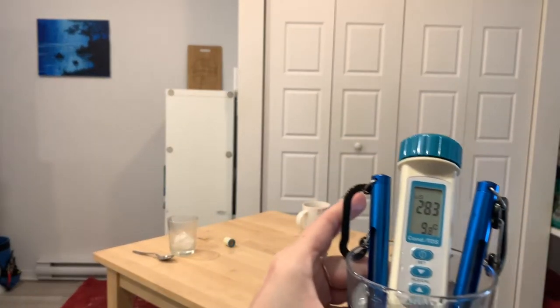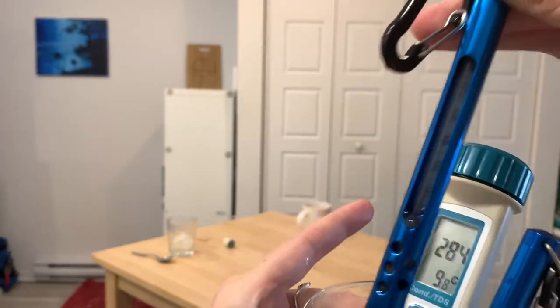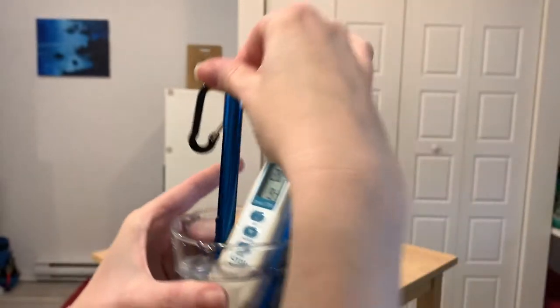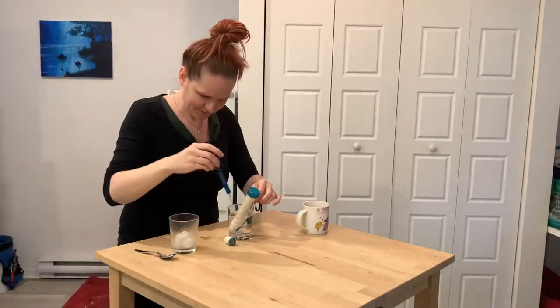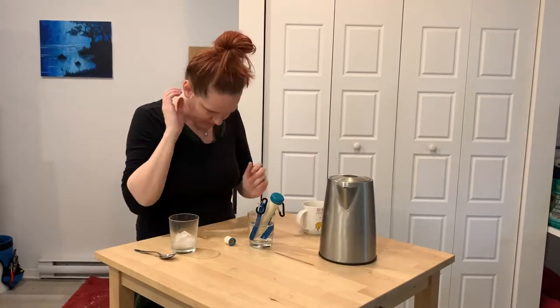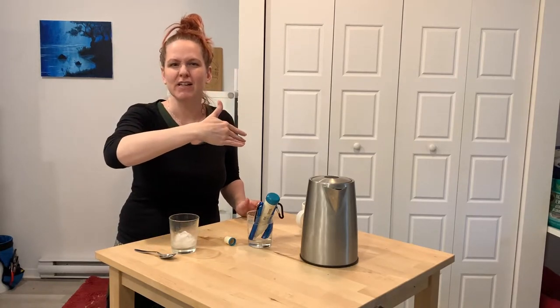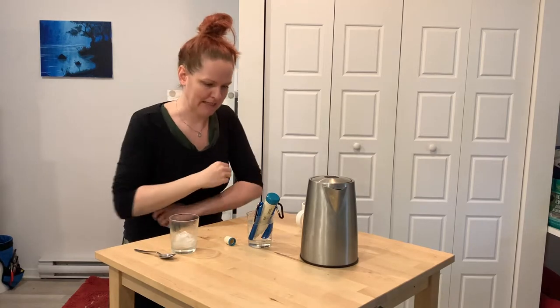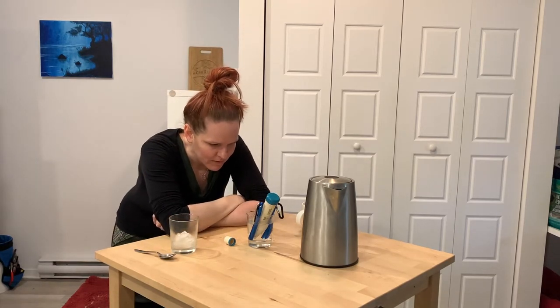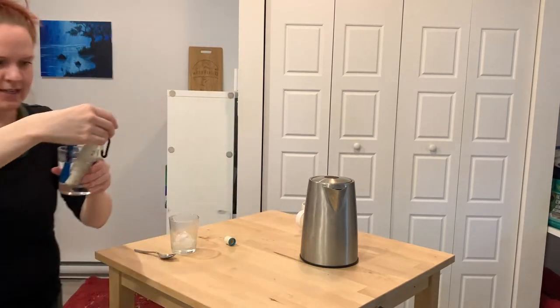We're about just shy below 10 degrees, and as you can see, 10 degrees — superb. I'm trying to look for readings at every five degrees as I go up. Now we're at 24.